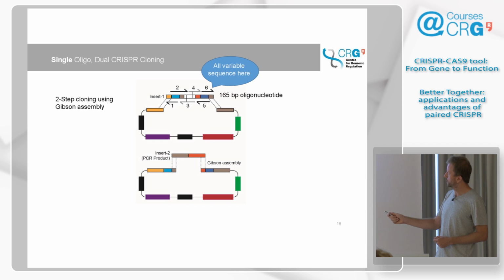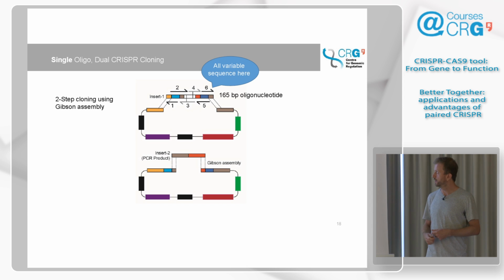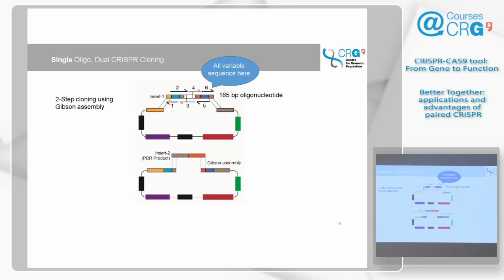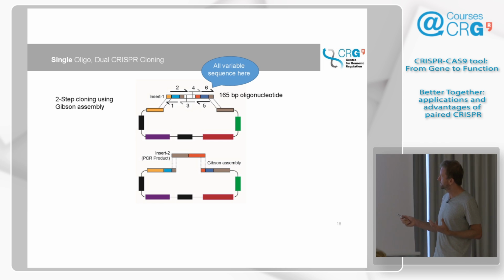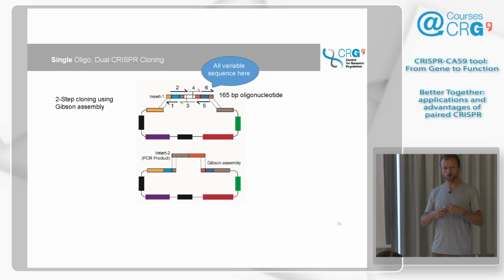We don't use regular ligation cloning. We use this Gibson method, which is a much more rapid and efficient way of cloning that you can read about. Many people are adopting this Gibson assembly. And by doing it this way, which may be a little bit counterintuitive, it gives you a lot of power and versatility for scaling up your experiments to very large scales.